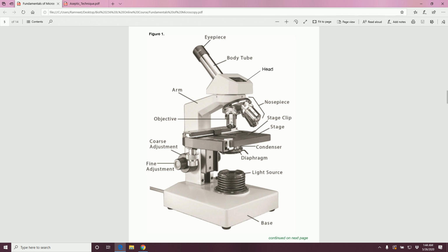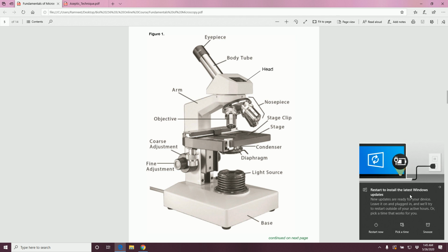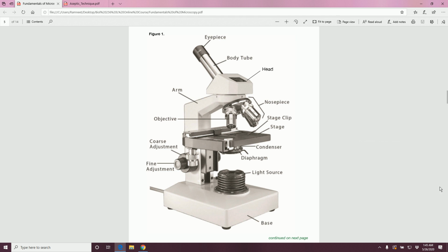So when the magnification is less, field of view is more. So when we increase the magnification, field of view decreases, because image becomes more zoomed. Because as we zoom image, the image becomes big, but we see the less area on the slide.